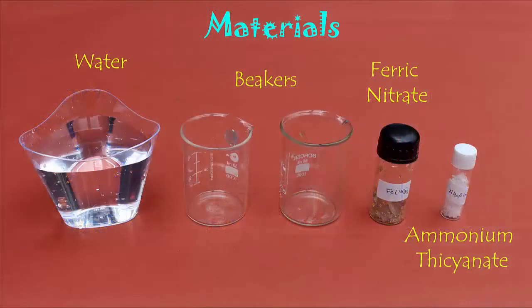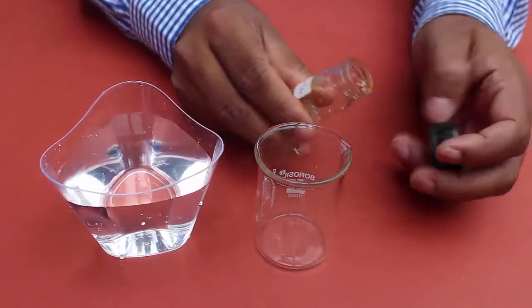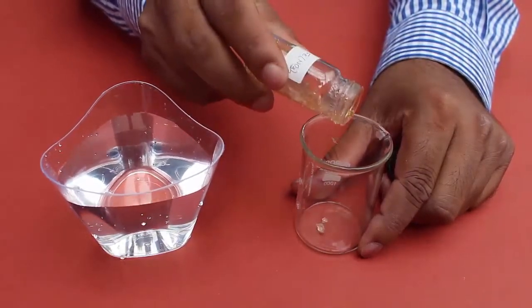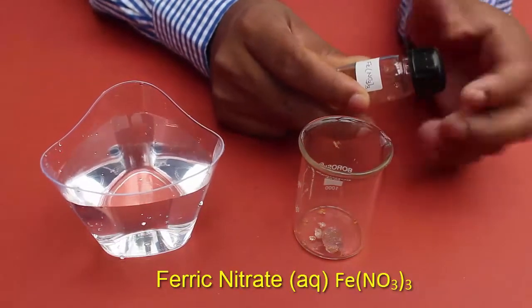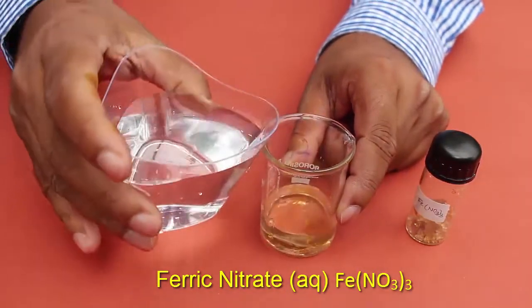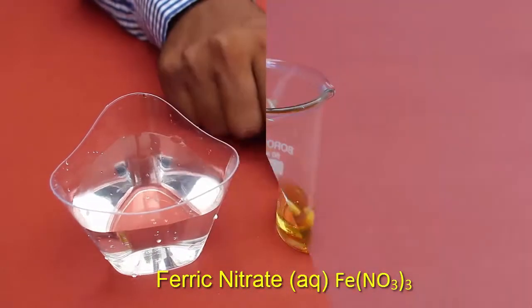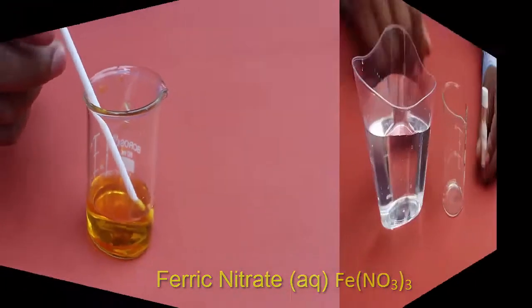First we will prepare a solution of ferric nitrate. For this we place some crystals of ferric nitrate in a beaker. Then we gently add some water to the beaker and keep stirring to make a uniform and proper mixture. This is the ferric nitrate solution.